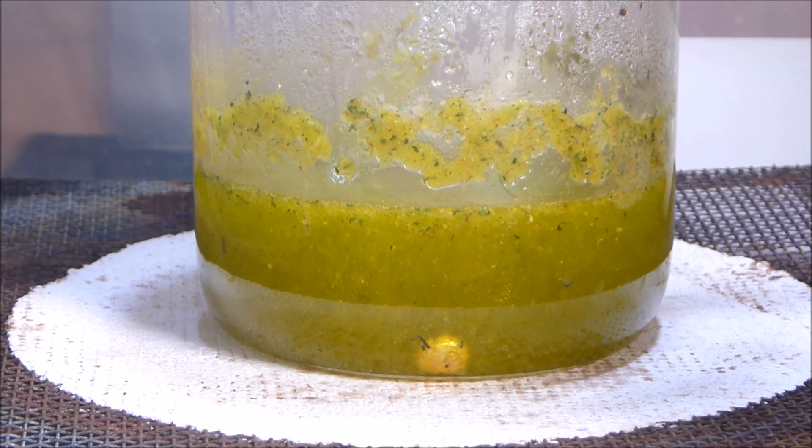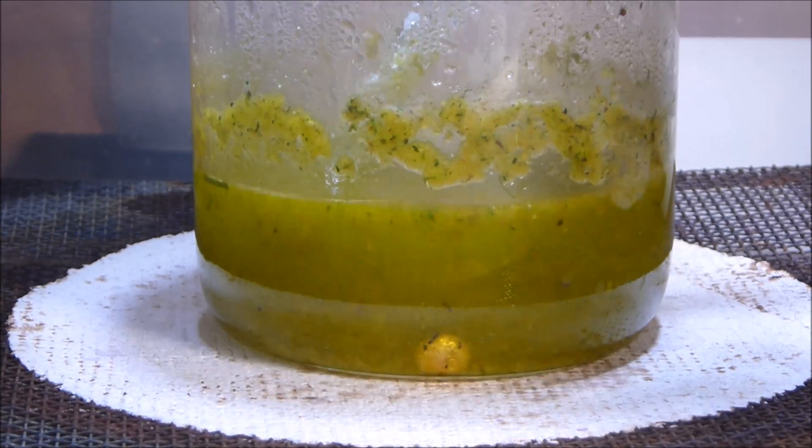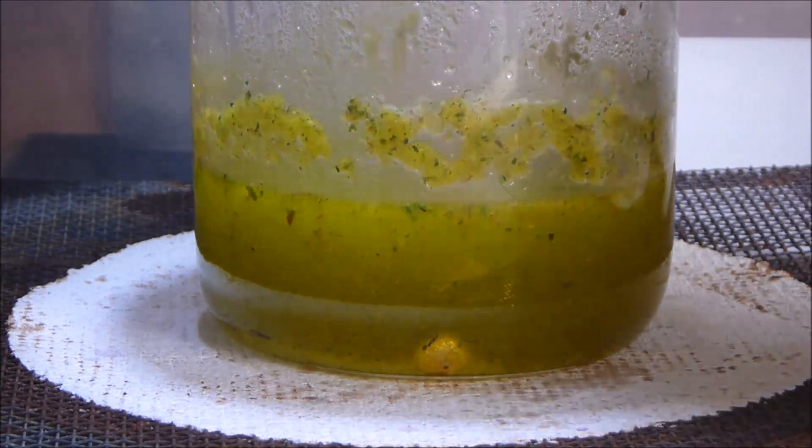I'm pretty sure there's still a reaction happening there so we're going to give it a little bit more. Much less of a reaction this time as you can see, so give it another stir.